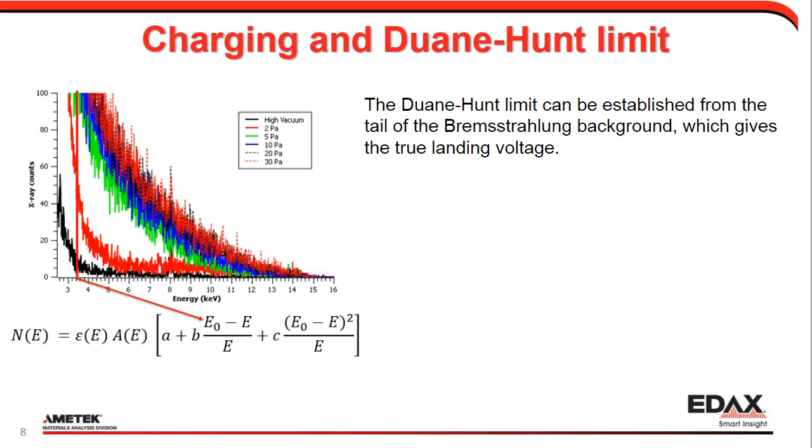There is a question about, does it matter what background modeling we're using? We have an old machine with non-mechanistic modeling. Depends on what you're trying to do.